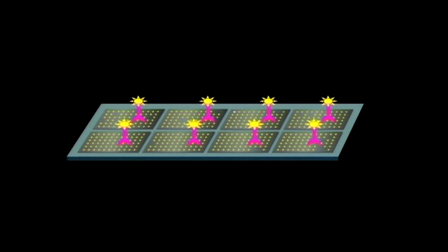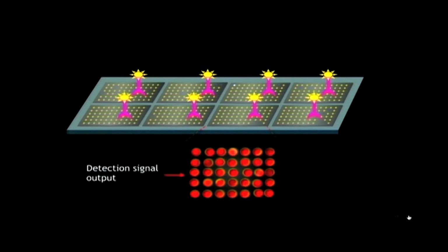The chips were probed with anti-GST antibodies to determine the reproducibility of protein expression and immobilization. This shows the uniform signals across the whole proteome array. The signals were observed for more than 90% of the proteins. And over 90% of the features contain 10 to 950 femtograms of the proteins.